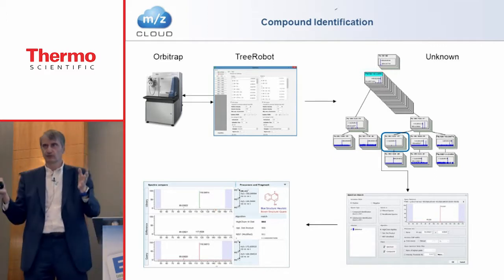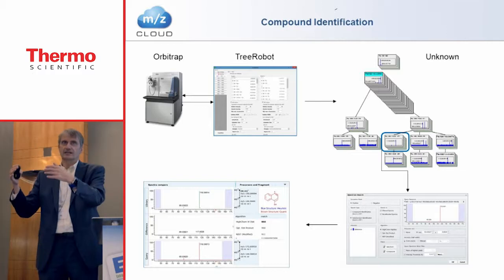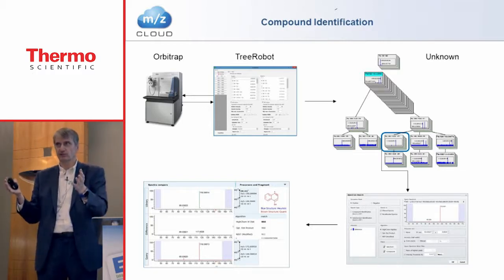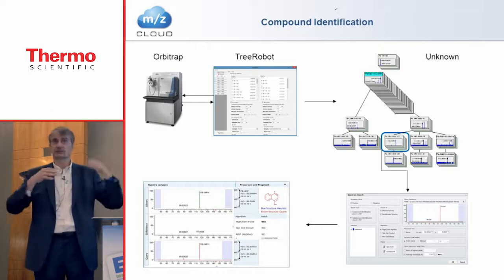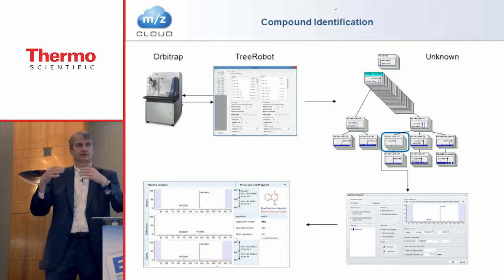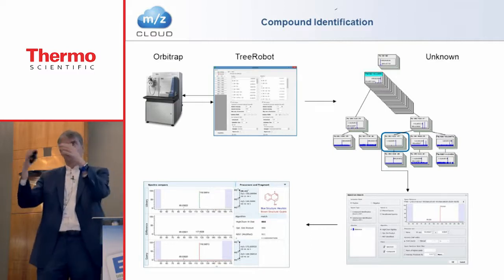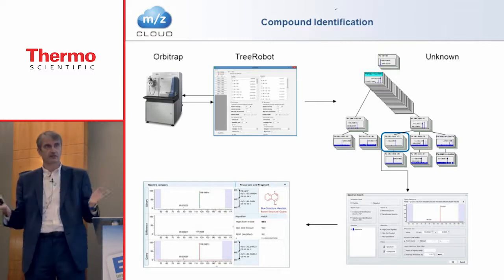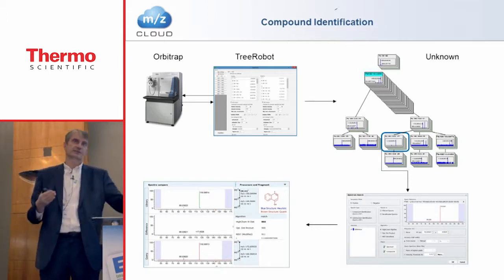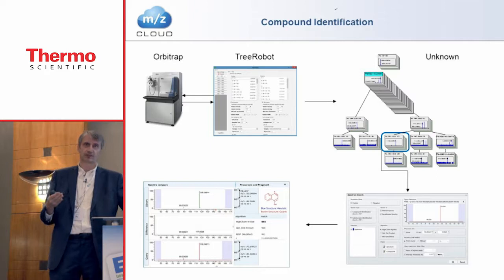Because many of you are working in a relatively limited structural space, you are not dealing with environmental compounds, where you can encounter everything. Therefore, we always recommend building an in-house database of compounds that are actually used in your company, because those substructures can later be found in your samples.